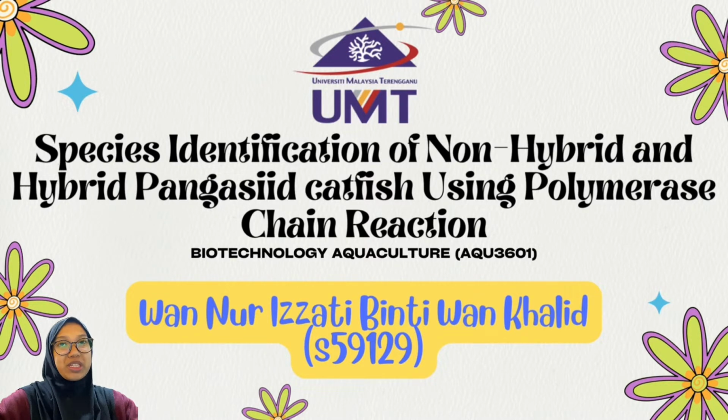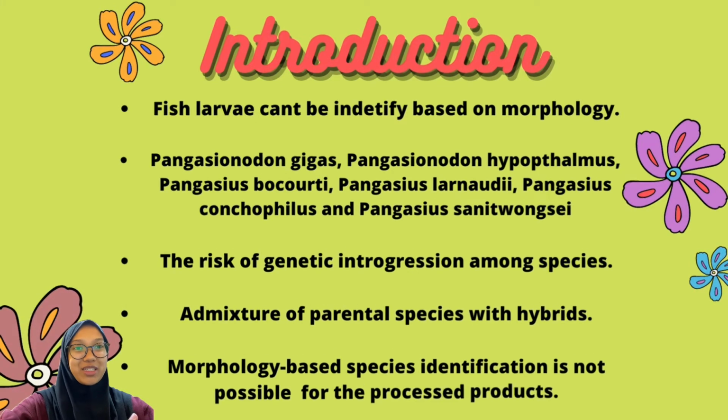Today I'm going to present about species identification of non-hybrid and hybrid Pangasiid catfish using polymerase chain reaction. First, we will go to the introduction.